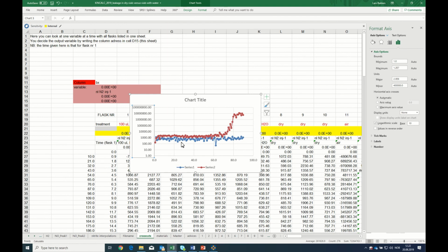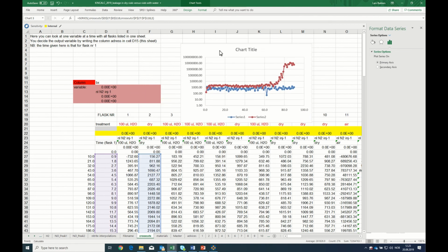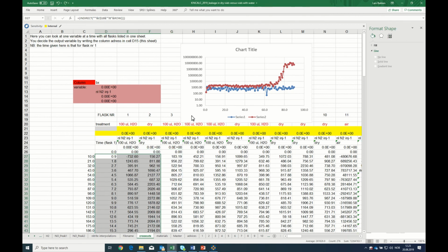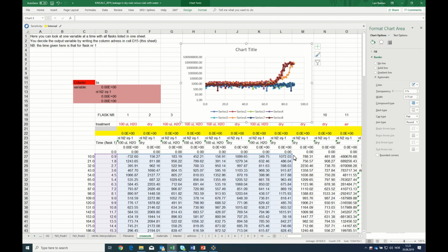And you see that the dry vial is having higher leaks throughout and escalating leaks towards the end. So this shows you how you robustly can scan through a whole set of experiments. Oops, sorry. I regret that change. So you can see how you have all the data together. And of course you can make average values, etc., etc.